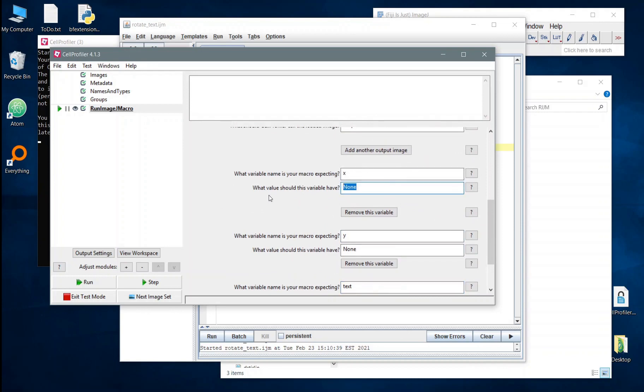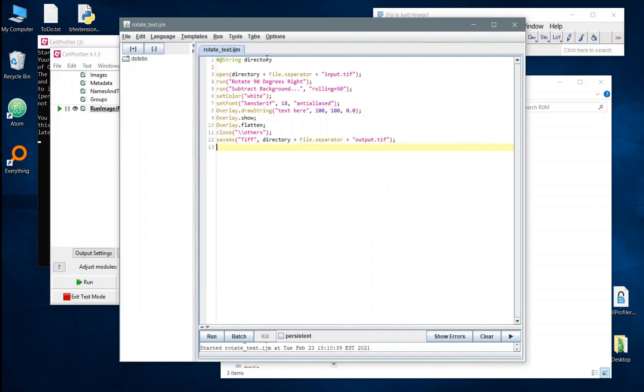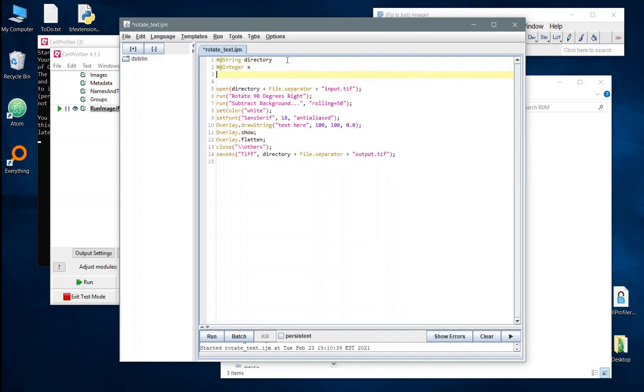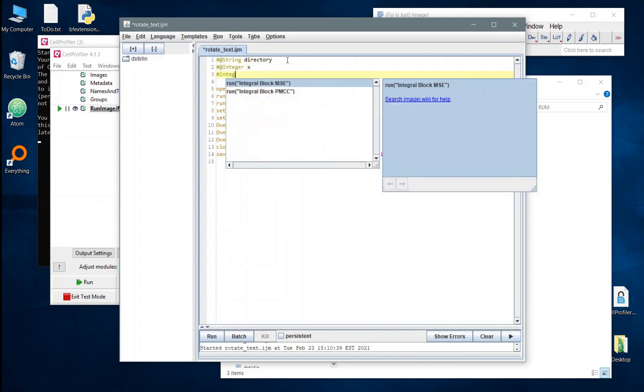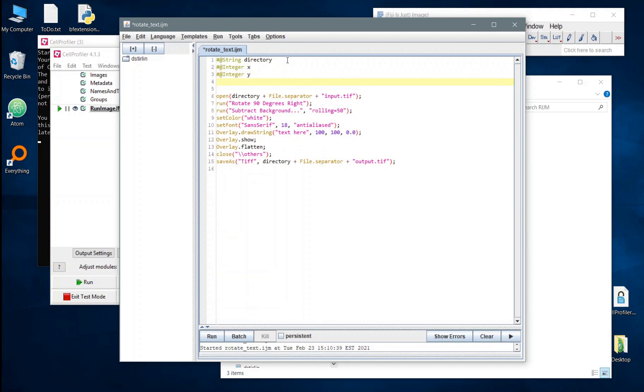Now these are obviously going to have to be numbers, but CellProfiler is probably going to deliver them as strings of text. And there we go. So we've got x, y, and text. And I'm going to want to add these up here with that string command there. So for x and y, we're probably going to want these to be considered as numbers. So we're going to call them integers.